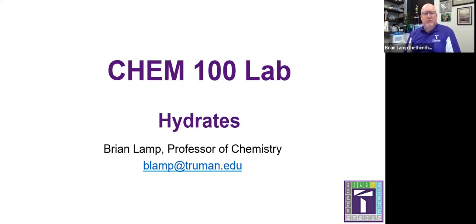Up till now, the experiments that we've done have really focused on making observations and making qualitative assessments of the different types of materials that we've explored. And the lab this week will actually be our first opportunity to make some quantitative measurements, in particular mass measurements, and use those mass measurements to do some calculations that let us learn a little bit about a particular hydrate that we'll be working to explore. And quantitative analysis is a big part of the development of science and of characterizing chemical materials.